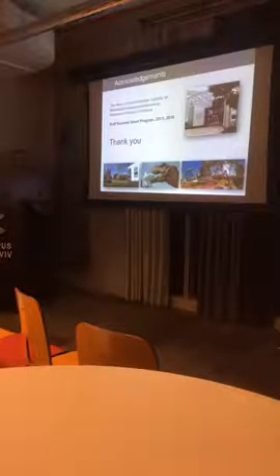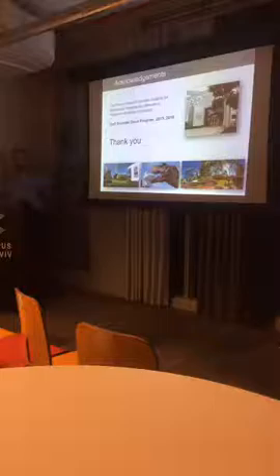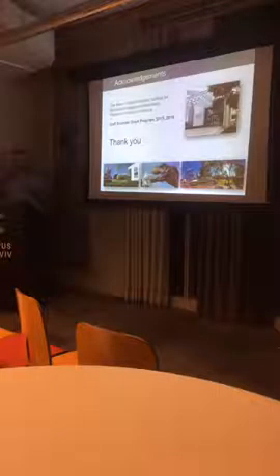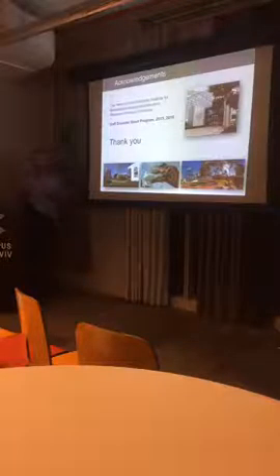Functional brain imaging? Functional brain imaging using speckles is very well established, and people do it in order to see different cortical activation. For example, the whisker system. Now we thought to combine it with the fluorescent system.